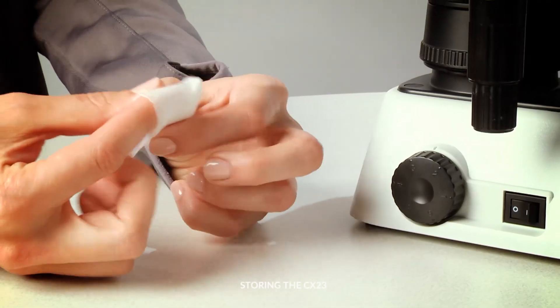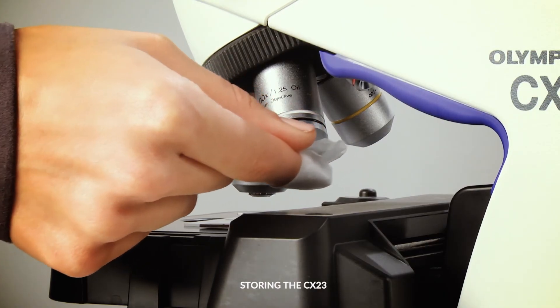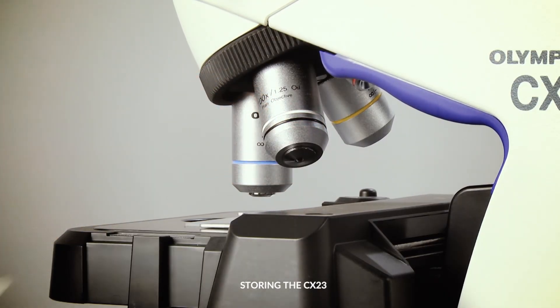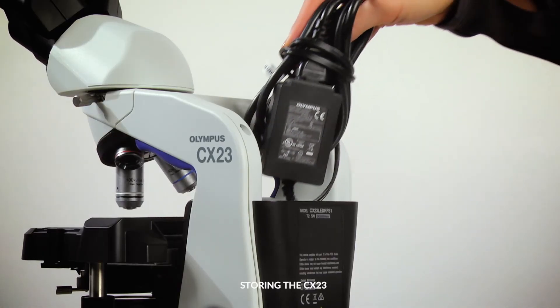Then, wrap lens paper around a finger and gently wipe with lens cleaner, drawing a spiral outward from the center. Unplug the microscope, wrap up the cords, and store them in the back pocket.